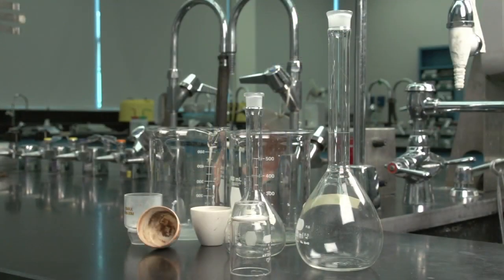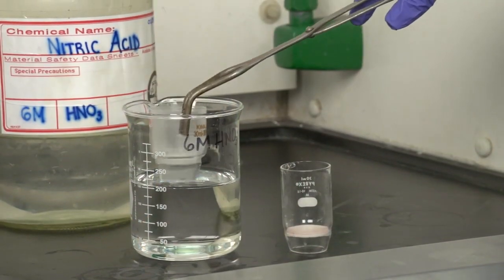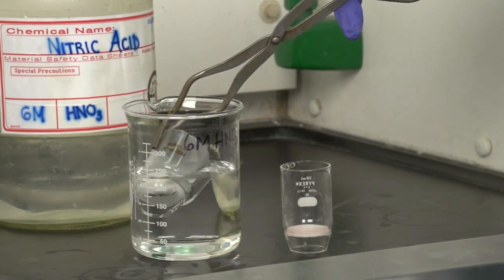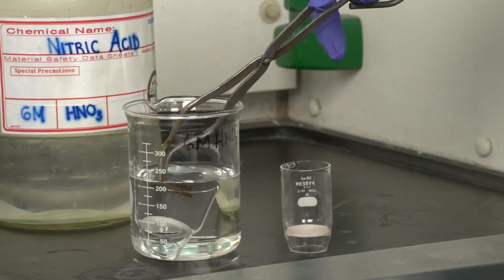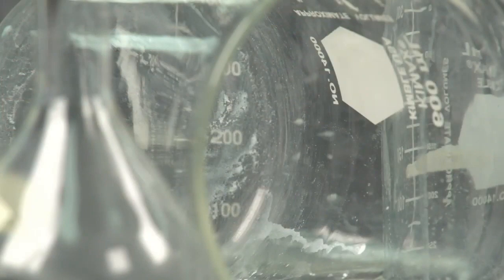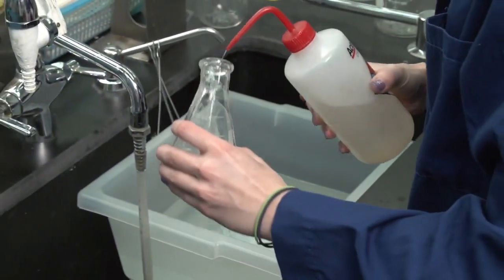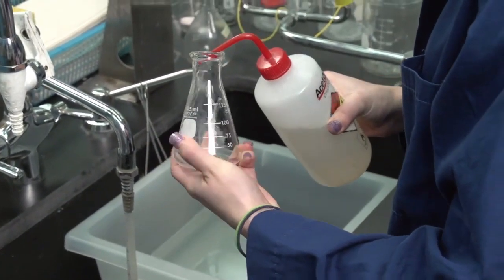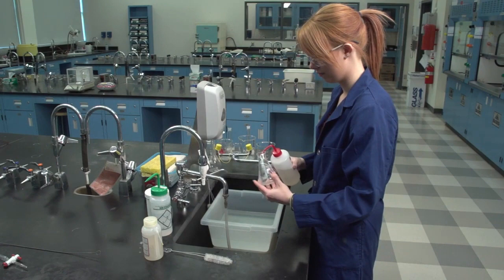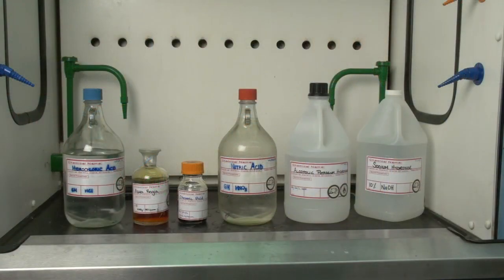Crucibles and other glassware that is contaminated with metals are cleaned by soaking in a solution of hydrochloric or nitric acid. Concentration is dependent on the type of residue to be removed. Glassware contaminated with organic materials is soaked in sodium hydroxide or organic solvents such as acetone or methanol. If soaking in the appropriate chemical agent is not sufficient, more corrosive agents have to be used.